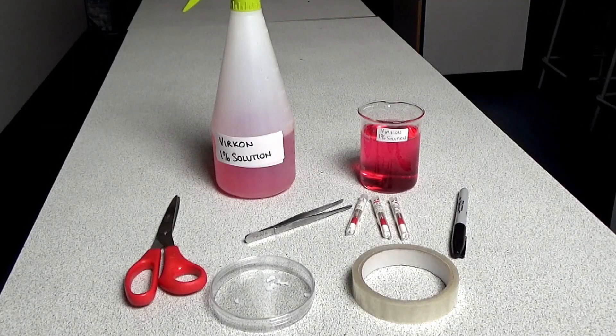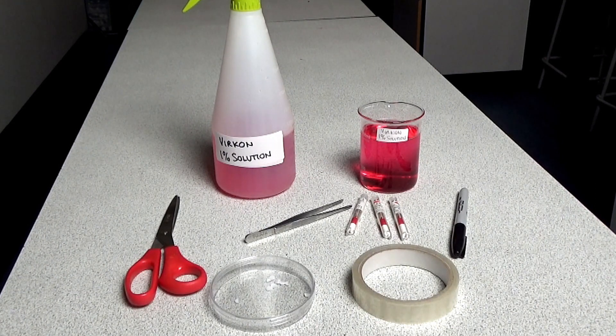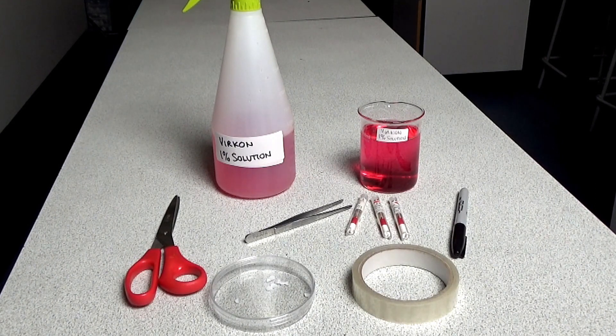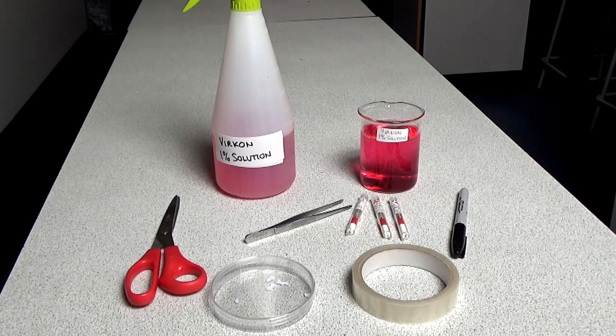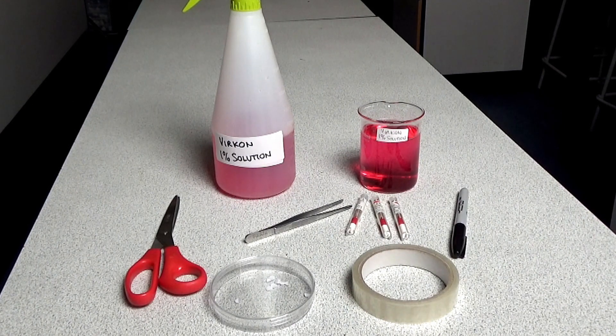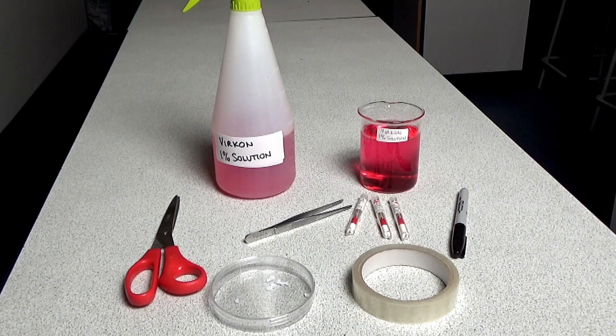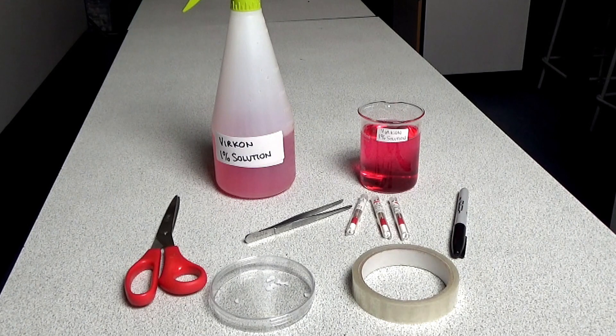You'll also need a permanent marker or chinagraph pencil, blank filter paper discs and a selection of antiseptics to test or alternatively pre-impregnated antibiotic discs, a discard beaker of vircon disinfectant, some forceps, a roll of sellotape and scissors to cut it, and it's also useful to have the vircon disinfectant in a spray bottle.